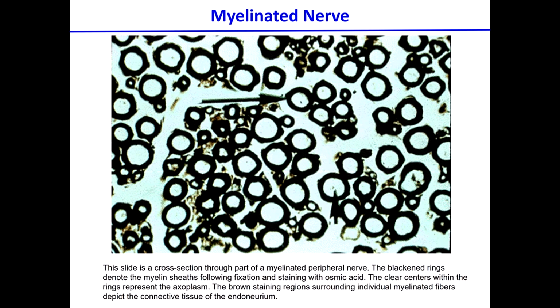Now, if you cut the nerves in a transversal form and you stain for myelin with something that definitely stains much darker than in the previous slide, this is what you see. Okay. You see plenty of nerve cells which are surrounded by myelin. There is also some portions of connective tissue that you can see here, looking kind of brownish in between them.